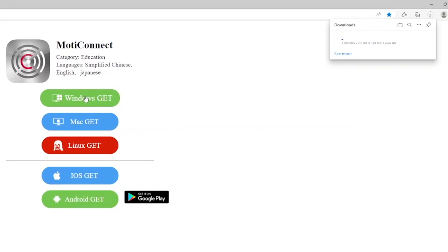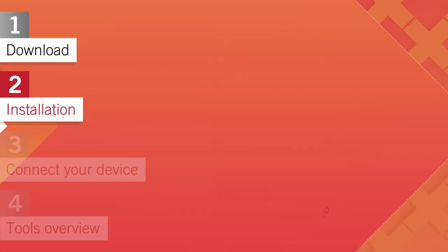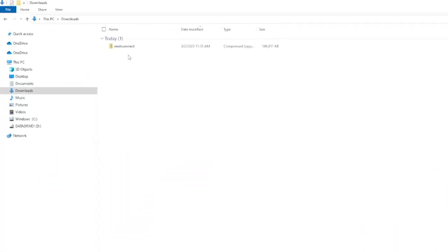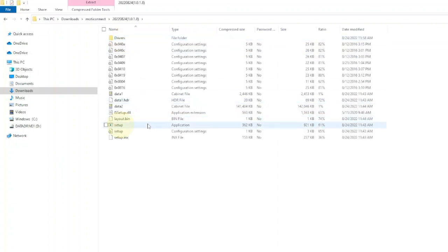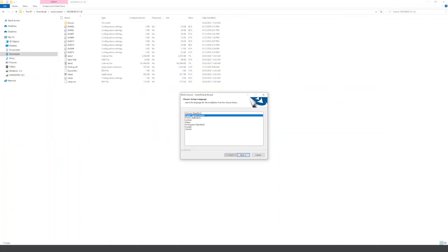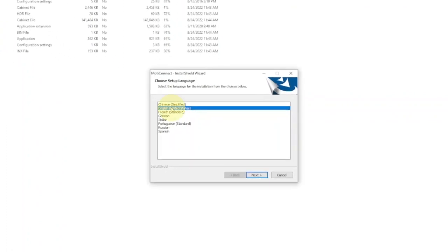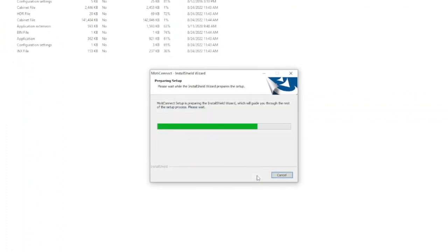Installation is simple and effortless. To install the program, locate your downloaded file and double-click on setup. Now it's time to select your desired language, which in our case will be English. Select next and wait for the setup to begin.